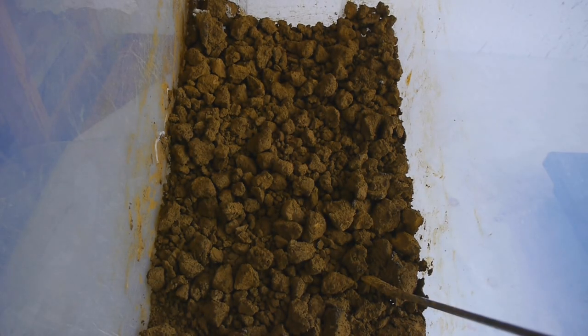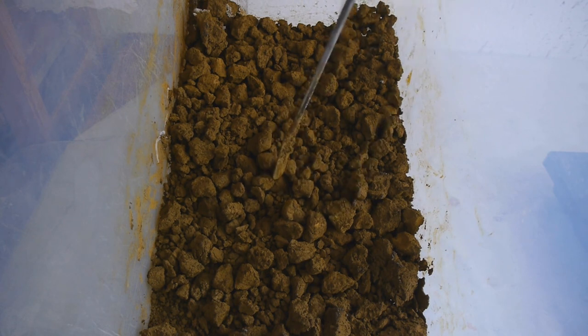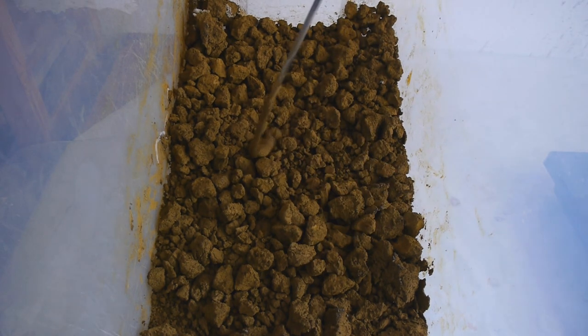This is now about 1 week later. The iron oxide looks relatively dry. Now this is still iron oxide hydroxide, and to get the real iron oxide, the Fe2O3, we need to heat this.